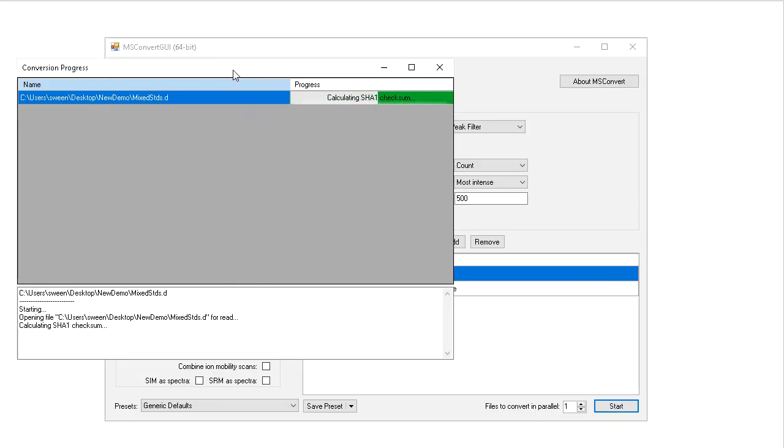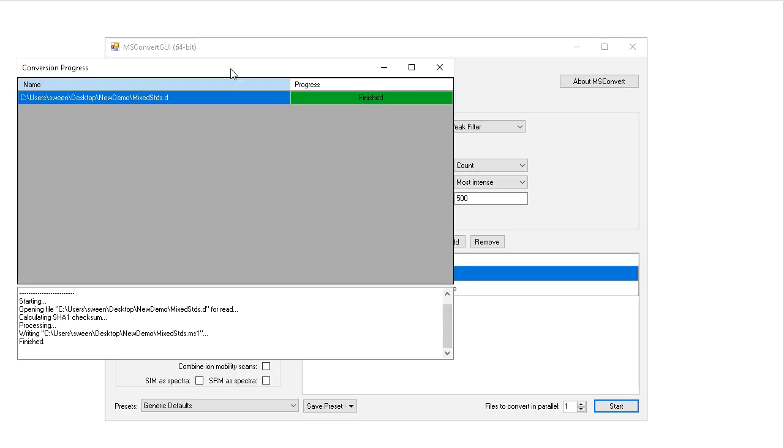So this was one LCMS run that was done in the DDA mode, and in DDA what you basically have is a series of cycles. First the instrument does a full scan and picks out a few precursor ions if they're above a certain threshold, and then it selects those precursors and does MS-MS on them, and then it repeats that cycle over and over. So what we're doing here is extracting the full scan data from the whole file. So that's done.